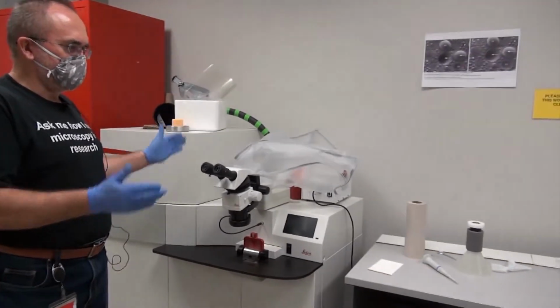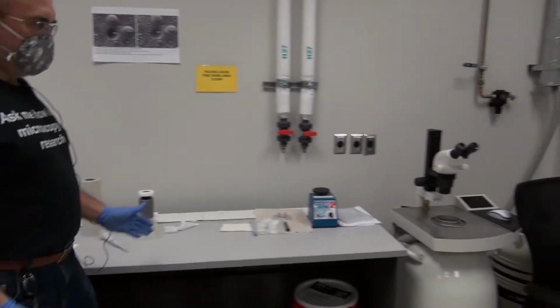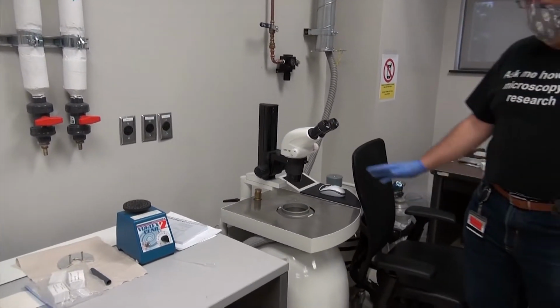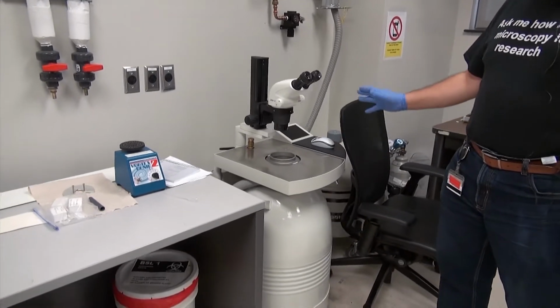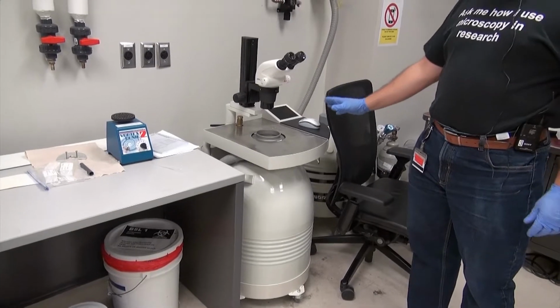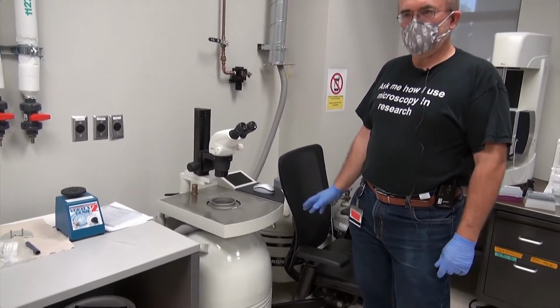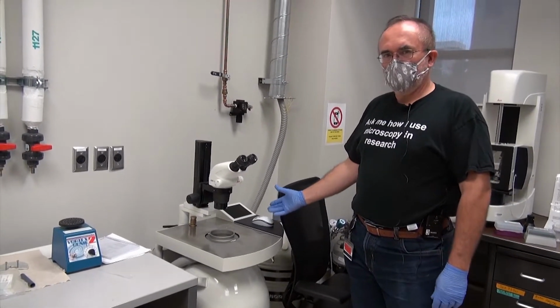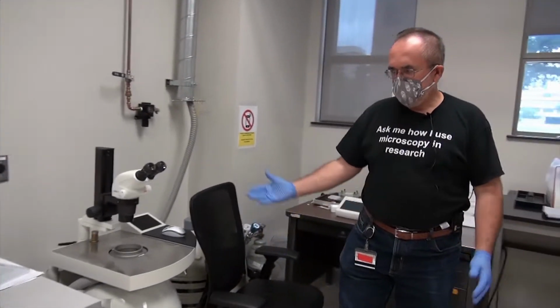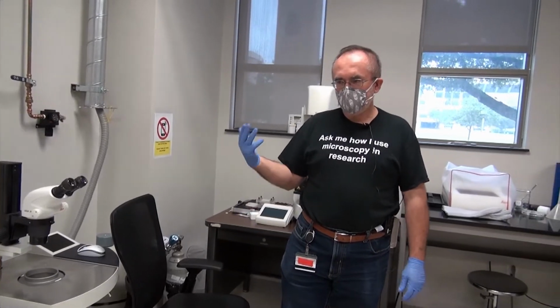Once the sample is vitrified, it is then transferred to the freeze substitution apparatus, where at approximately -80 or -90 centigrade, the water in the sample is replaced with solvent, typically acetone, without recrystallization of ice. And then this sample can be processed through regular resin embedding for sectioning and transmission electron microscopy.